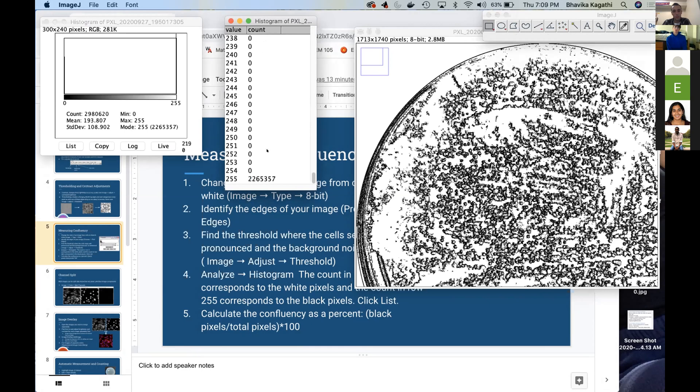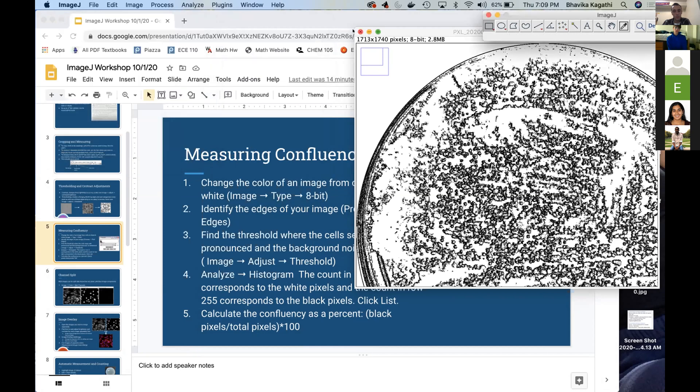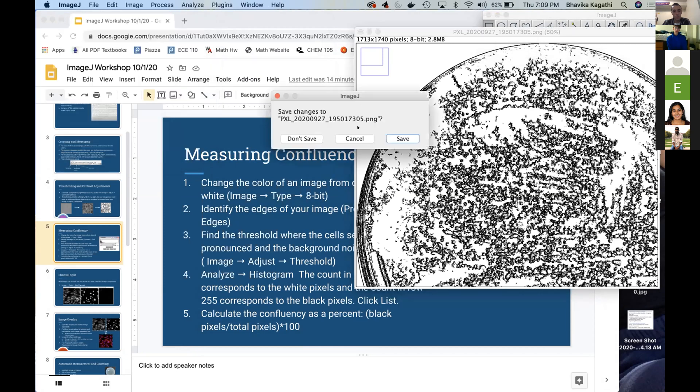And then you can divide those numbers and multiply by 100 to find the ratio of black pixels on the picture, which is essentially the amount of pixels that are cells. And then don't save.